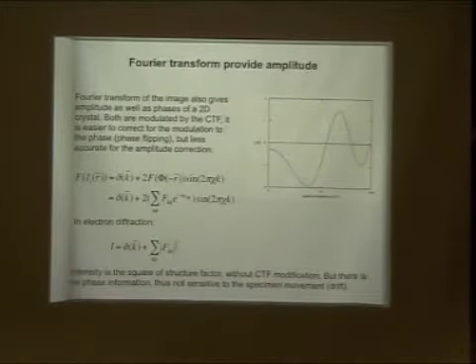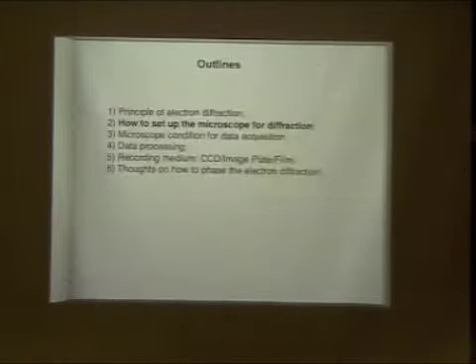Of course, a lot of the time the crystal is too small and it's difficult to do the actual diffraction. Therefore, there's no choice; you have to get both from the image. But if you do have a choice, if your crystal is large enough to do the diffraction, it is always better to get your amplitude from diffraction than from the image. So this is basically how the image is formed, how diffraction is formed, and why you need the diffraction.